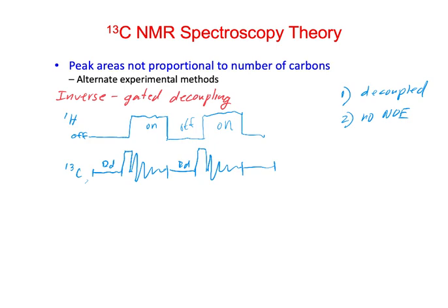I think it's essentially no. And so, if we run this experiment with the relaxation delay long enough, say greater than 5 times the T1, because we removed the NOE, we should be able to integrate the carbons in this spectrum with inverse gated decoupling.